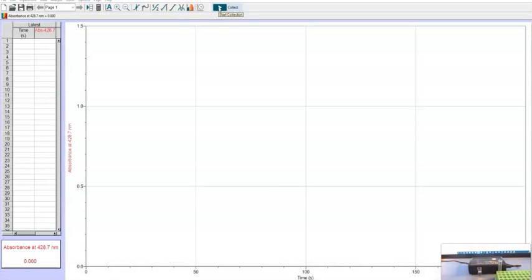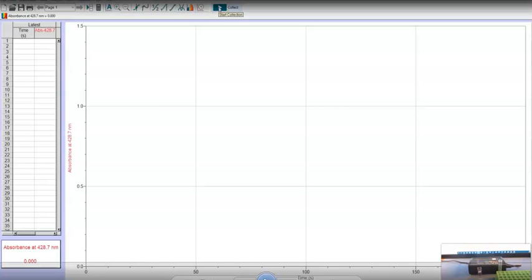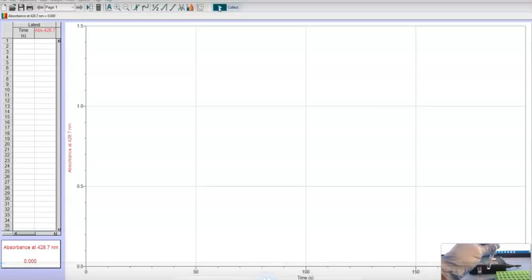So here's the same experiment that you just saw, except instead of using a pH 7 buffer, I used a pH 6 buffer. So let's take a look and see what's going to happen here. Again, in the cuvette, I've got the substrate, catechol, with some pH 6 buffer, and I've got some pH 6 buffer and enzyme in the glass tube. I'm going to mix them together.